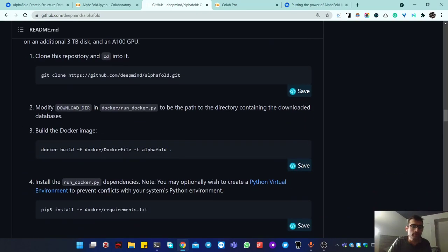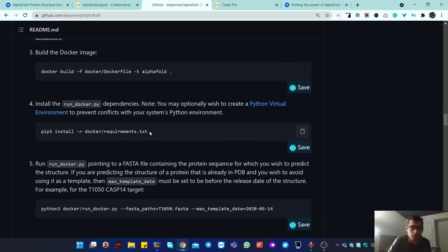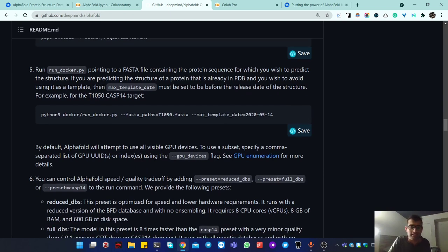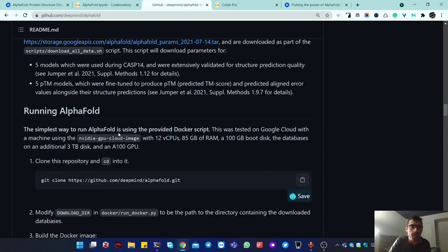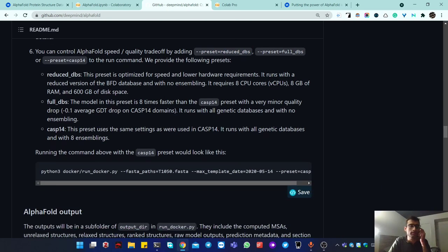If you have enough space, you can run 'download all' and it will download everything into your database folder. After that, it's straightforward: there's a config file where you put the path to your database folder, then copy and run the main command. You'll also need Docker installed — search Google for how to install Docker, or I can make a video on that. Finally, you provide the path to your FASTA file containing your protein sequence. If you don't have the full disk space, use the reduced database flag. That's the basics of running AlphaFold locally.